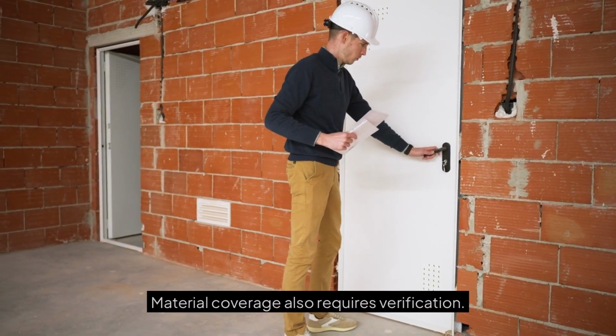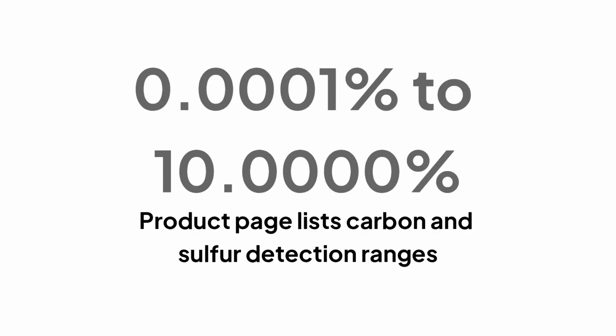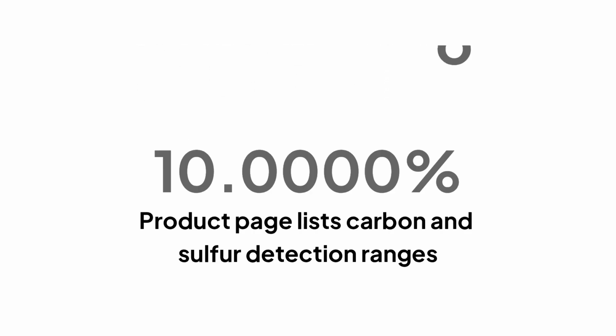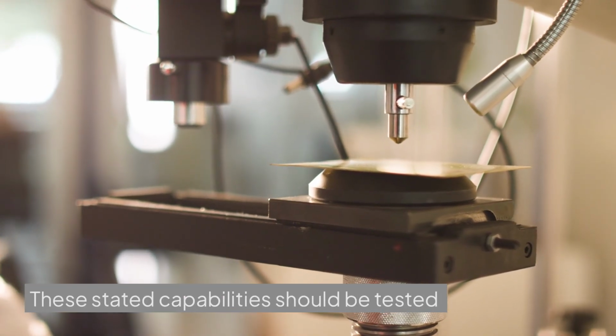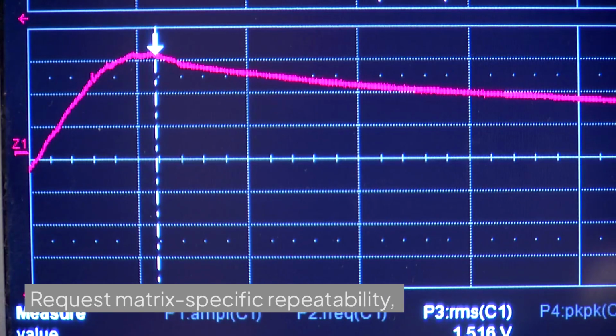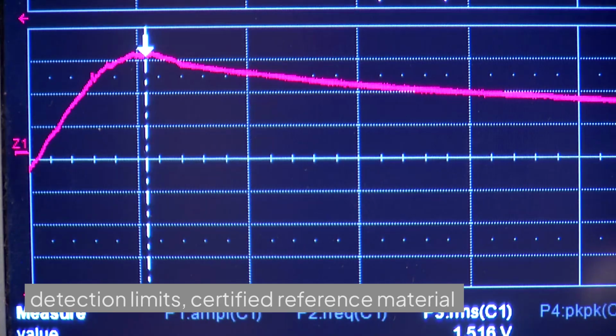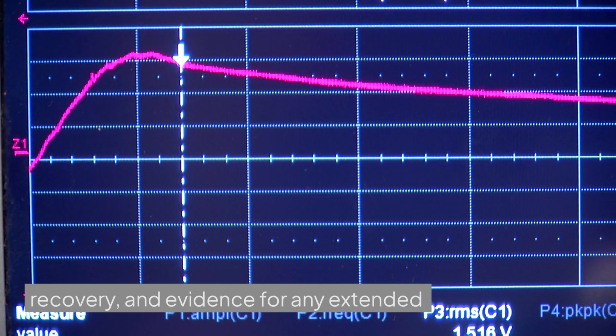Material coverage also requires verification. The product page lists carbon from 0.0001% to 10.0000% and sulfur from 0.0001% to 3.5000% with extended ranges described as possible. These stated capabilities should be tested against the actual grades and returned scrap streams in the laboratory. Request matrix-specific repeatability, detection limits, certified reference material recovery, and evidence for any extended range.